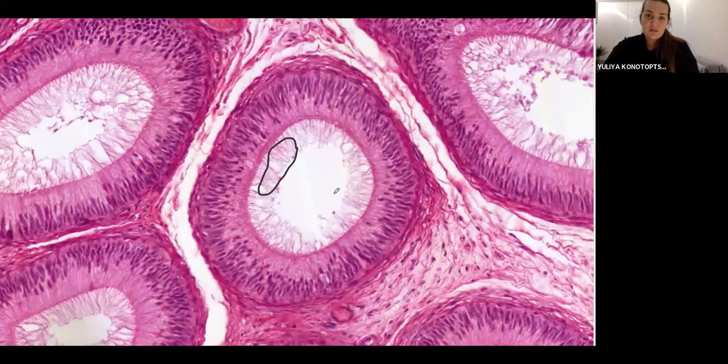And then here you see that it's very evident that these are my stereocilia. Do you see how long? It's insane. They're super, super long. Okay, and actually, fun fact, you have this exact picture in your big histo room on the right side as one of the paintings. I think it's the first or second towards the board. So yeah, it's very special place. So with a picture like this, you don't even need to see the bigger picture. You know exactly that this is epididymis, because super long stereocilia.